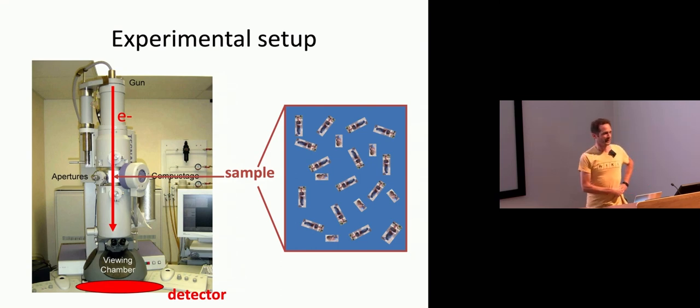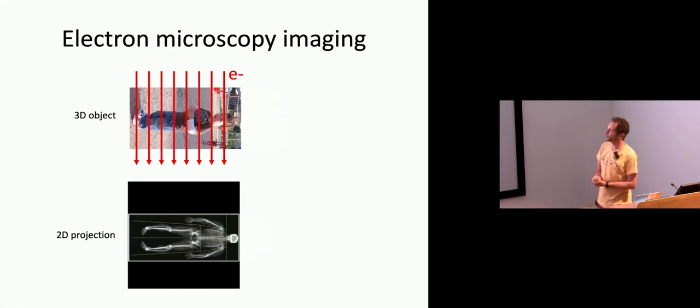There are many copies of Jan, and for now we're going to assume they're all in the same three-dimensional conformation. But all these copies are swimming into different orientations in this little shallow swimming pool when it is rapidly frozen in liquid ethane, as discussed earlier. Then it goes inside the electron microscope, and in the microscope we will take transmission electron microscopy images. So the electrons will go through Jan and will generate a picture that would perhaps look much like an X-ray scan of Jan in the hospital.